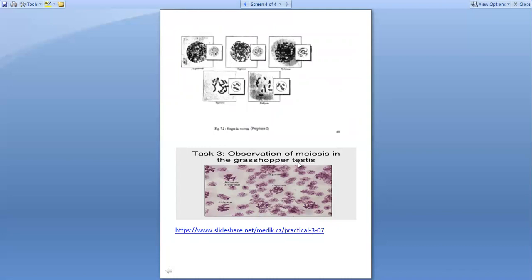This is a diagram taken from a specimen showing under the microscope how these phases are being seen. This is diplotene, diakinesis, and pachytene.